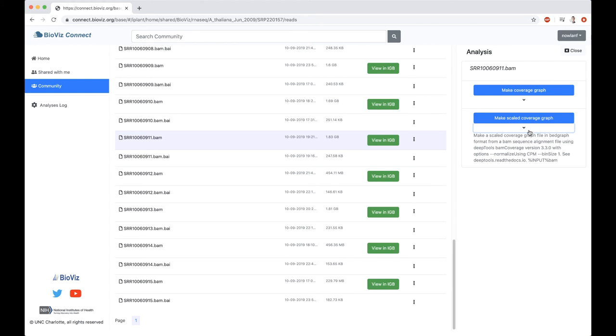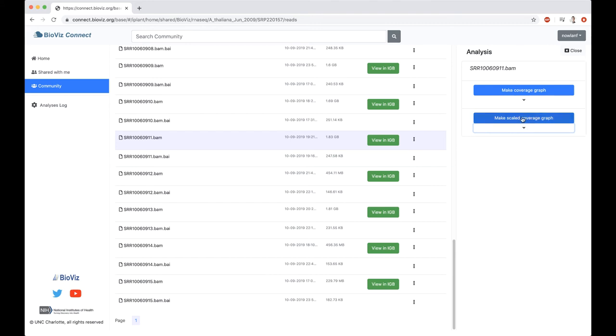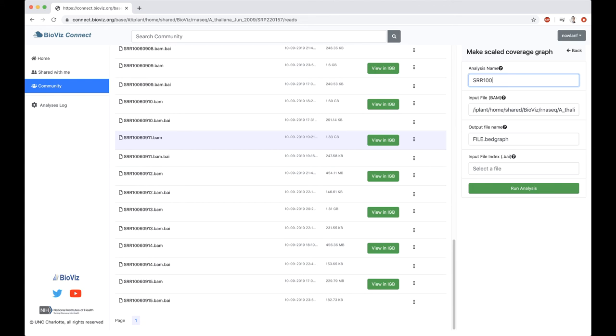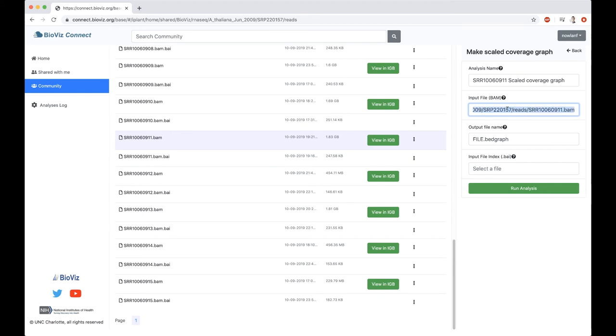You can click on here to see more about it. This is using DeepTools BAM coverage, and it's going to do some scaling on that using counts per million mapped reads. I'm going to go ahead and click on Make Scaled Coverage Graph. We've got a couple options available to us. Try to keep it pretty basic. I'm going to name this my file name. It's SRR10060911. I'm just going to say Scaled Coverage Graph. This is just for my own knowledge of what I'm running. We've auto-filled in the BAM file here.